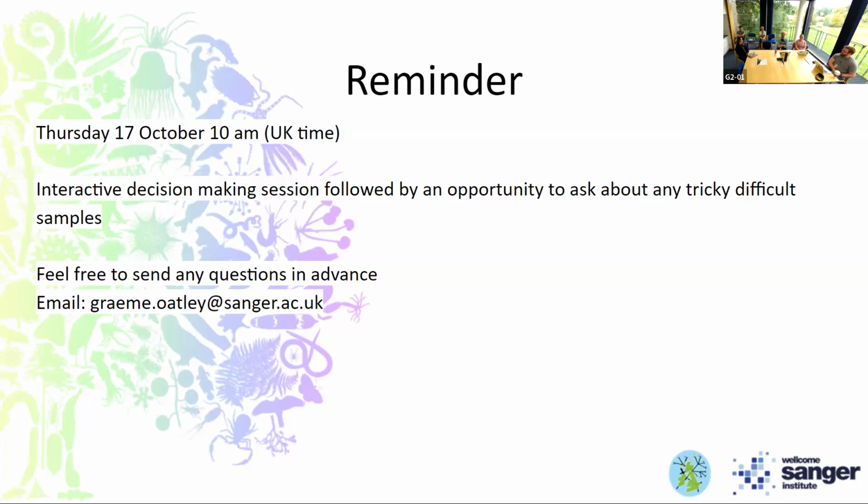Yeah, so generally for most protocols that we develop, we have a panel of R&D species. So we'll develop the protocol conceptually, and try it on these panel species. For plants, I think it represents a diverse taxonomic group. So you trial them on those, and if you get good results from that trial or multiple trials until you've figured out something that works, then you can try on a small scale of production samples to see if it translates into normal production samples and then roll it out.